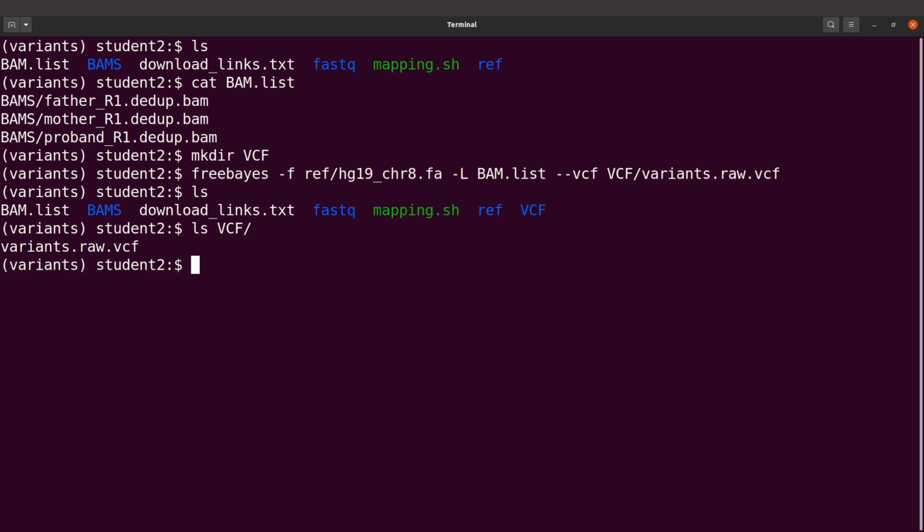And then you can also use other downstream analysis tools to analyze your data. For example, after variant calling, you can perform variant annotation. You can also look at variant effects. So you can also do your GWAS analysis, etc. There are a lot of things you can do here. So it depends on the questions that you want to answer. But everything starts after you have generated your VCF. So this is why this tutorial comes in handy. So learn this to generate your VCF files, and then you can proceed with your analysis.